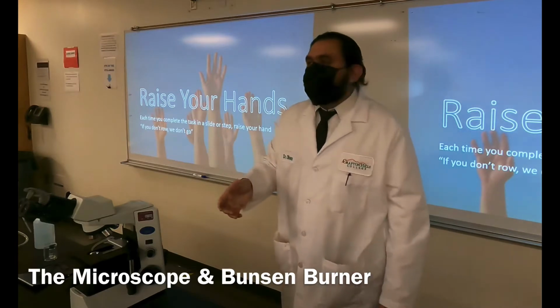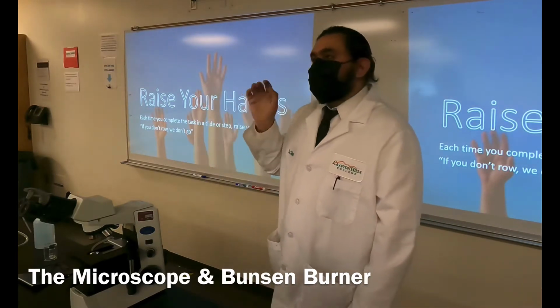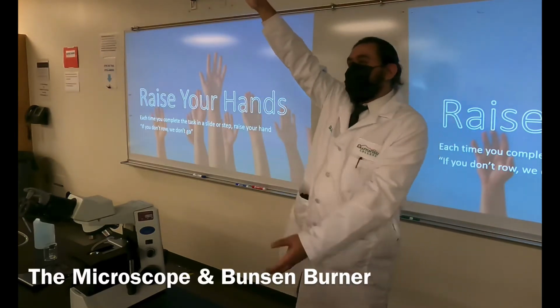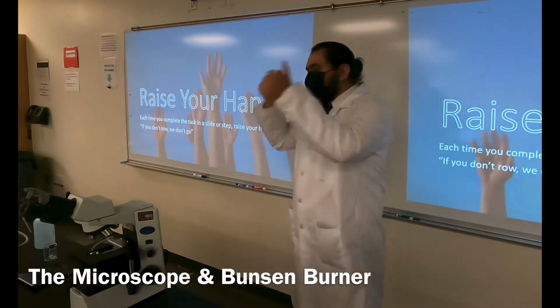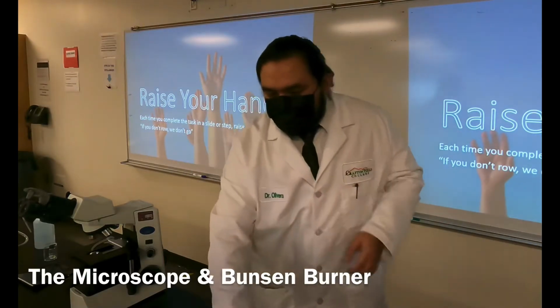Now I do appreciate the fact that you're not going to do this, right? This is called a T-Rex hand. This doesn't work. I need you to make sure you have your hand all the way up so that I can smell your armpit. That's the idea. If the person 10 feet away from you can smell you, you're doing a good job. So again, until all of us are doing this, we can't move on.